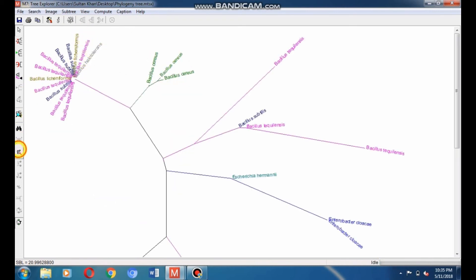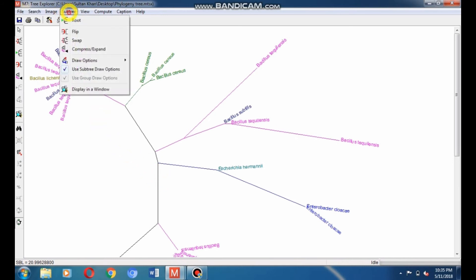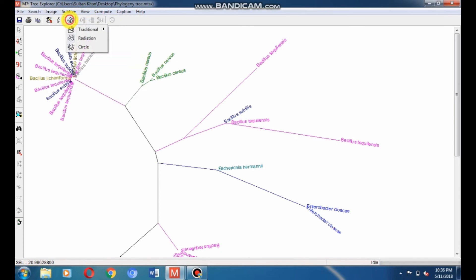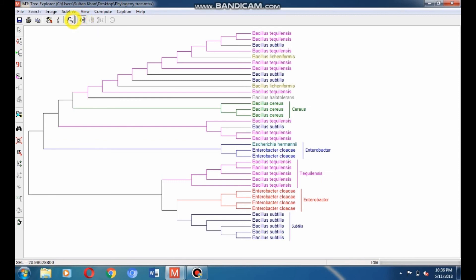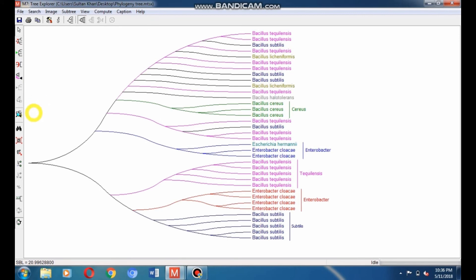You can make a radiation tree by going to Tree Style and selecting Radiation — the radiation tree will form. You can resize it according to your desired size or compress it using the resizing tool. Go to Traditional Style and select Rectangular Tree — the tree will form. You can make the tree in different styles, such as curved style, or convert it to rectangular.